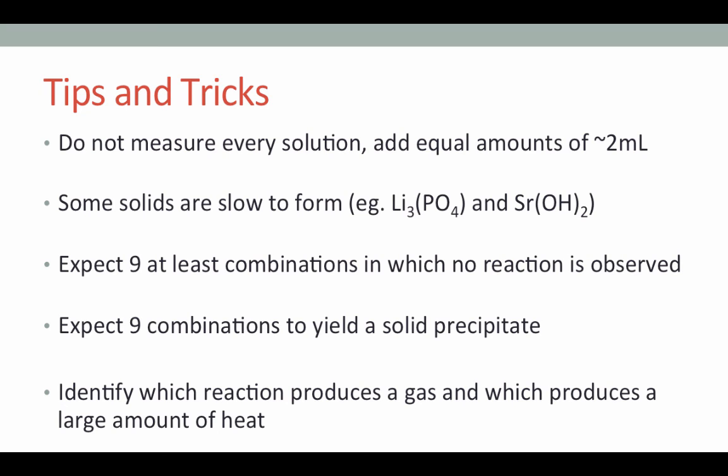Once you've mixed two reactants together, they might immediately form a solid, but they might also take a little longer to form that solid. So let the tubes sit on your bench for about 5 minutes, give them a tap every so often to mix the contents, and if you still don't see a solid formed, you can place these tubes in a warm water bath and leave them for 10 minutes to see if a solid will form. If after these 10 minutes you still do not see a solid, then you conclude that no reaction has occurred.